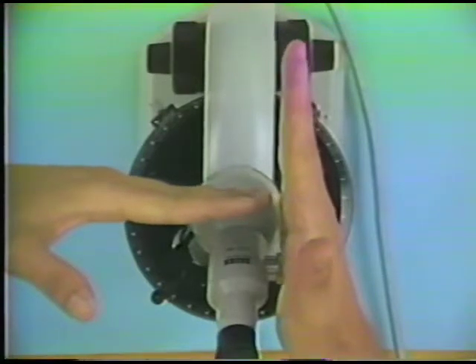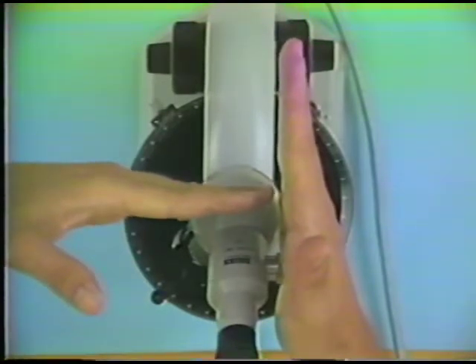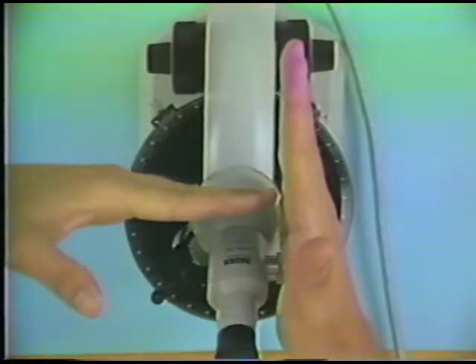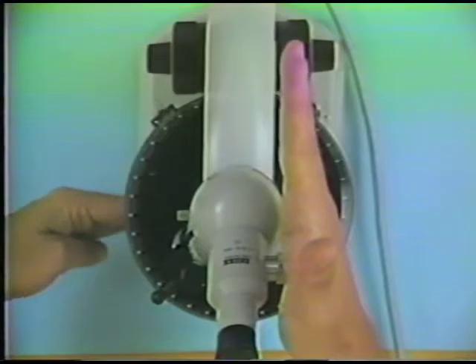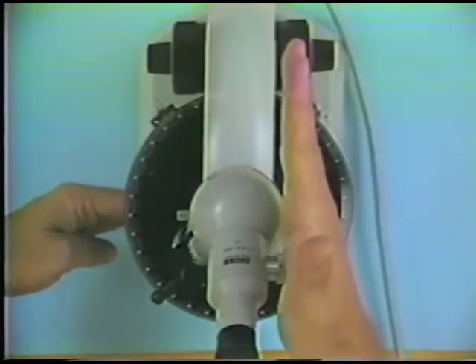What you find is if you have another brand of microscope, this might be reversed, and you should try to find out which way your polarizers are. If it's a Zeiss microscope, it's certain to be east-west below and north-south above. And it does make a difference in some optical tests.